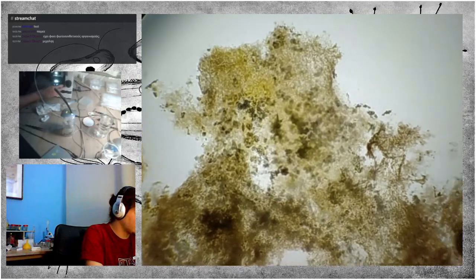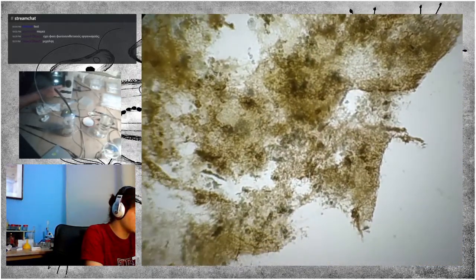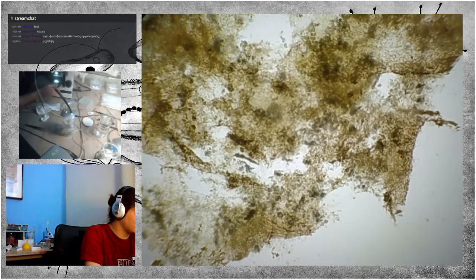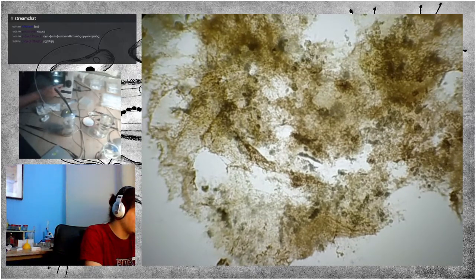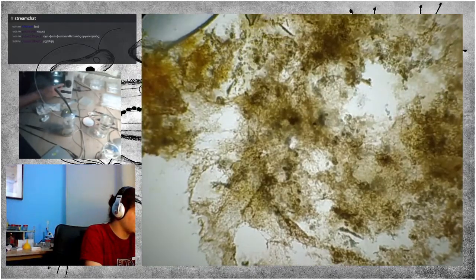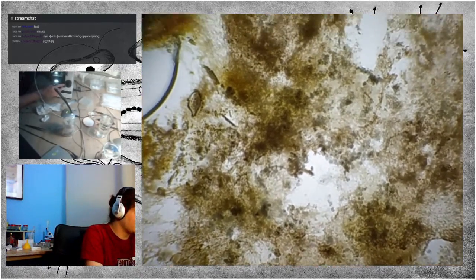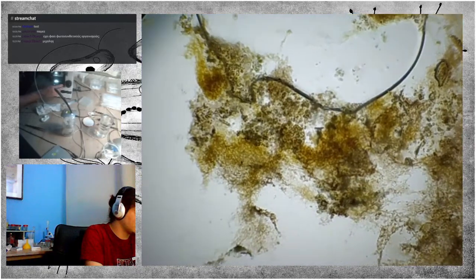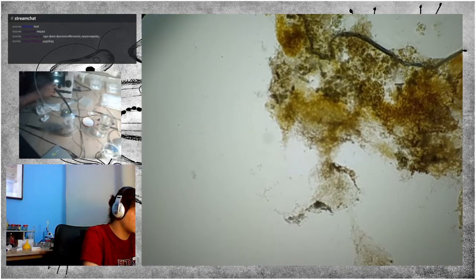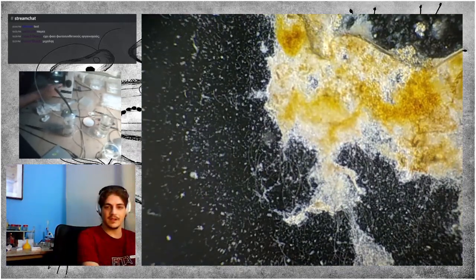The biofilm could be either fungus, which has grown on top of, inside the water and has floated up, or bacteria, which have obviously formed large colonies, or both. One that I had found was both and was quite impressive. Let me see if I can... Now this is dark field.